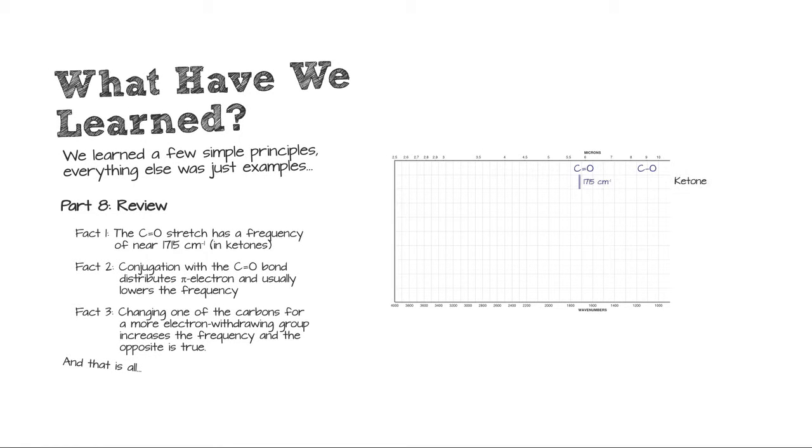So here we have a ketone, and we expect to see the ketone stretch at 1715. There's, of course, no carbon-oxygen single bond in a ketone. Here we have an ester, a little higher, around 1740, a typical frequency, and we expect to see a carbon-oxygen single bond, a good strong peak somewhere between 1100 and 1300. With amides, the CO stretch is a lot lower, and we look for NH stretches up above 3200, basically in the range where we look for OH stretches.